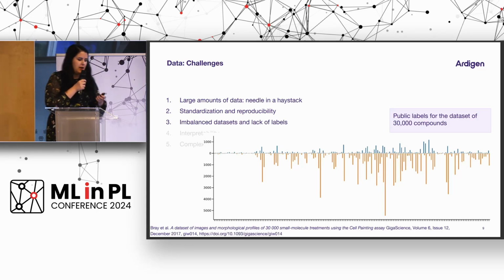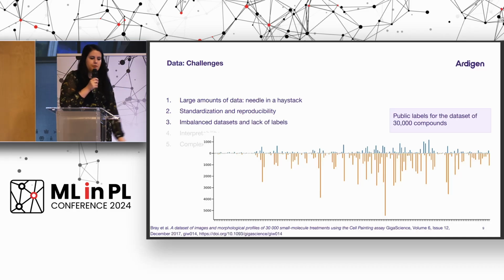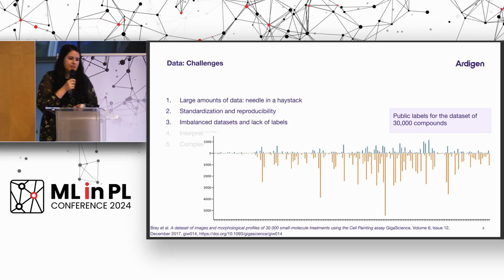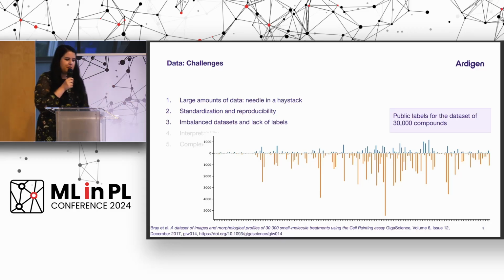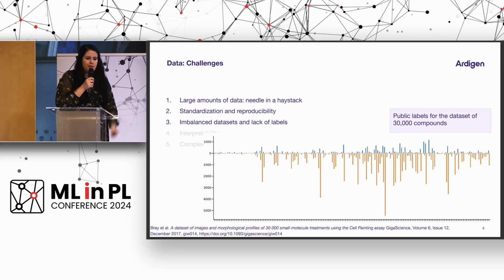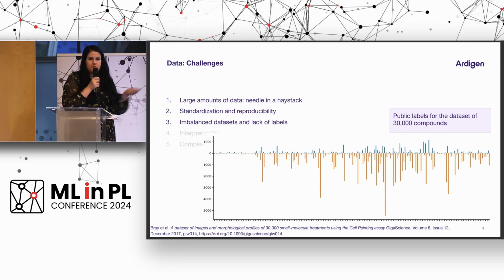And as you can see, we have a lot of tasks that do not have any labels. We have a lot of negatives in comparison to the positives. So for deep learning model training, this is a nightmare to derive some statistics and create cross-validation. It's very hard to divide those compounds, and training those models is not as easy as we wanted it to be.